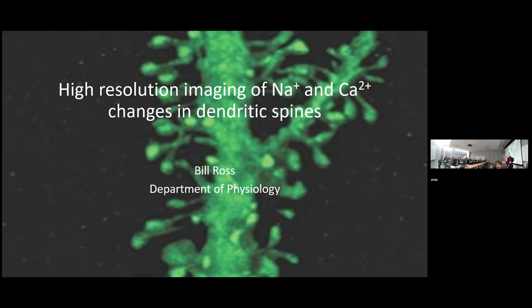And also we're going to have a different temporal perspective. What we've seen so far have largely been pictures, but there's no time in what we've seen for the most part. I'm going to be showing you dynamic changes in cellular properties, largely using indicators that can respond rapidly to changes in sodium and calcium concentration. I'll go into more detail about that as we go along.